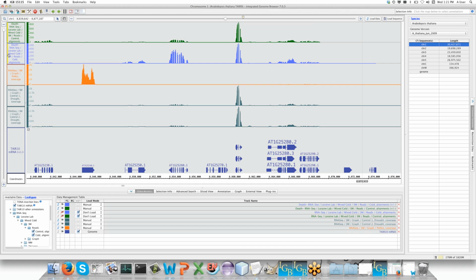And you can see that little yellow IGB track mark indicating that this is a track that was created by IGB, and if you want to keep the data, you'll need to save it. So right off the bat, I'm going to do a few things to make this easier to work with. I don't like having huge long names when I'm doing my analysis. So I'm going to click on the name in the track, and I'm going to change it to something short.